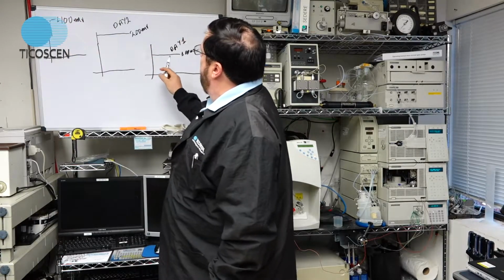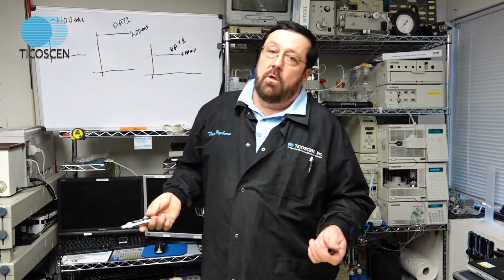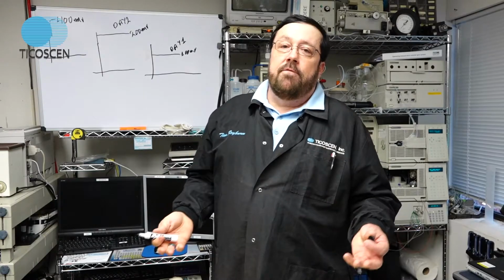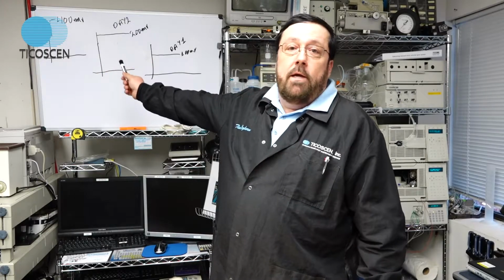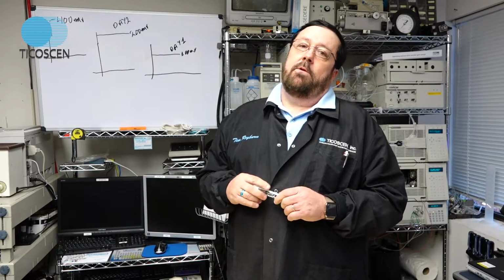And the reason this is happening, your turbidity is increasing in your water each day, is because life forms are growing in water. Water is a magnet for life. We don't want that in the scientific laboratory. Everybody treats water like it's a solvent, which it is. We take baths in it, we drink it. This water may be drinkable for a week or 2 weeks. However, for an ELSD, the turbidity will be so high that you'll get bad results and interference with your peaks. So water purity is incredibly important for scientific purposes if you want to keep your ELSD running correctly.